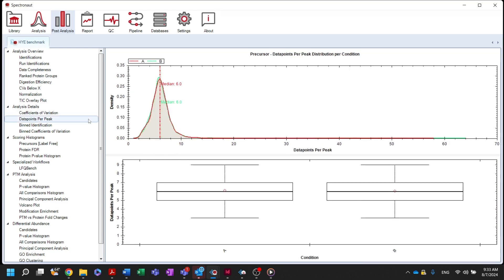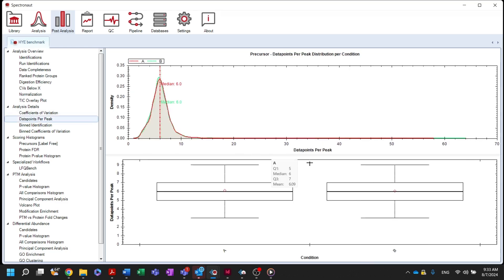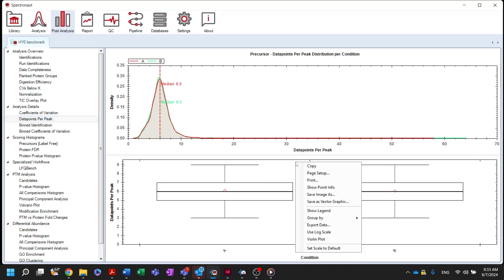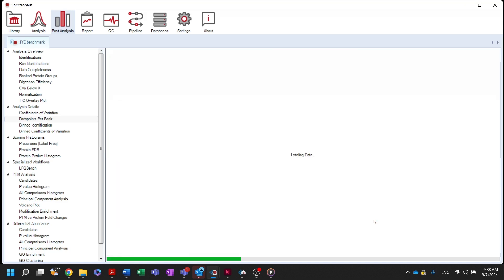Similarly, the data points per peak in each condition can be visualized in the data points per peak node. Right-clicking allows the user to group the data by run, condition, or experiment.